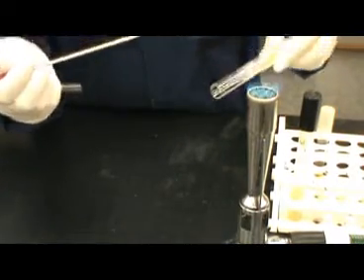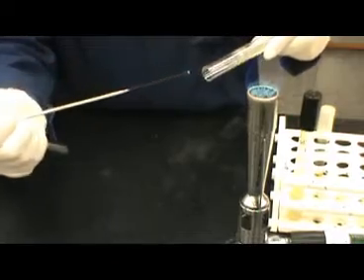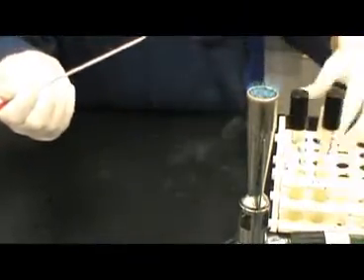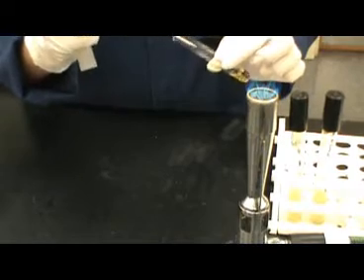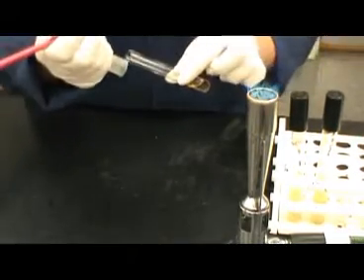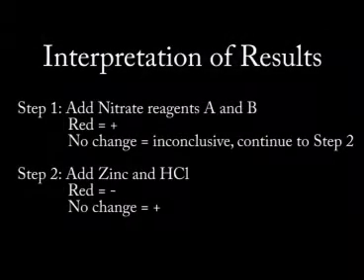Many soil organisms are an important part of the nitrogen cycle, and the enzymes nitrate reductase and nitrite reductase are used by many organisms in the conversion of nitrogen into various forms for use by plants or other organisms. Shown here is the simple broth inoculation used for the nitrate test. Make sure to flame your loop in between each bacteria.